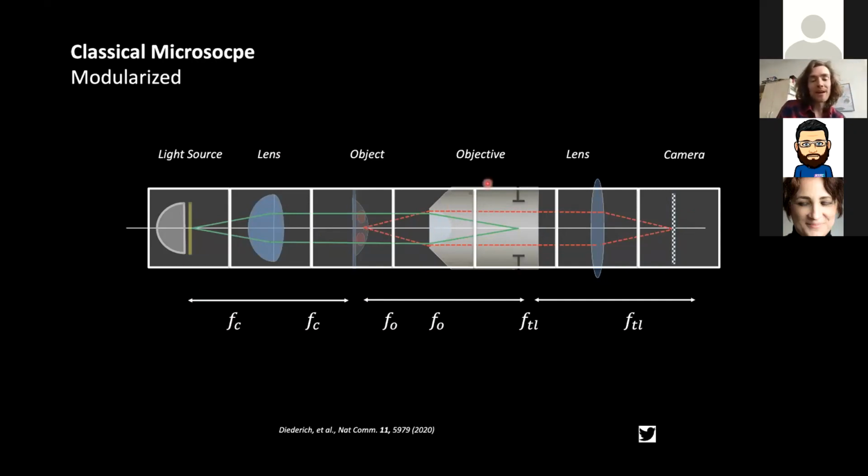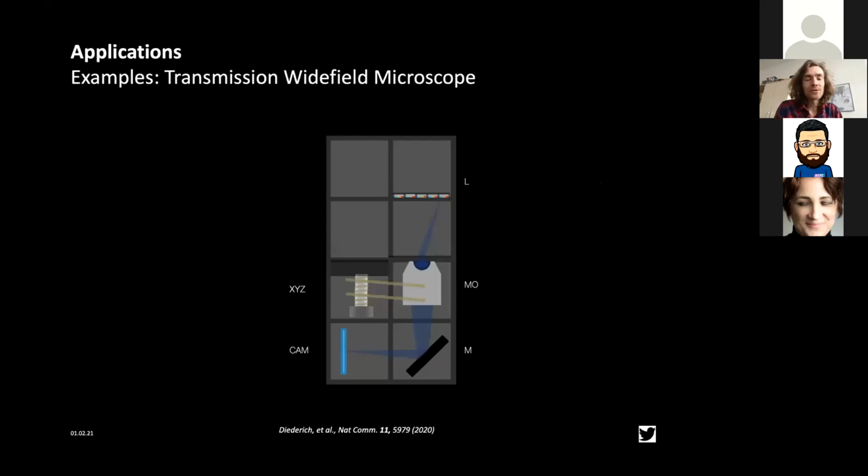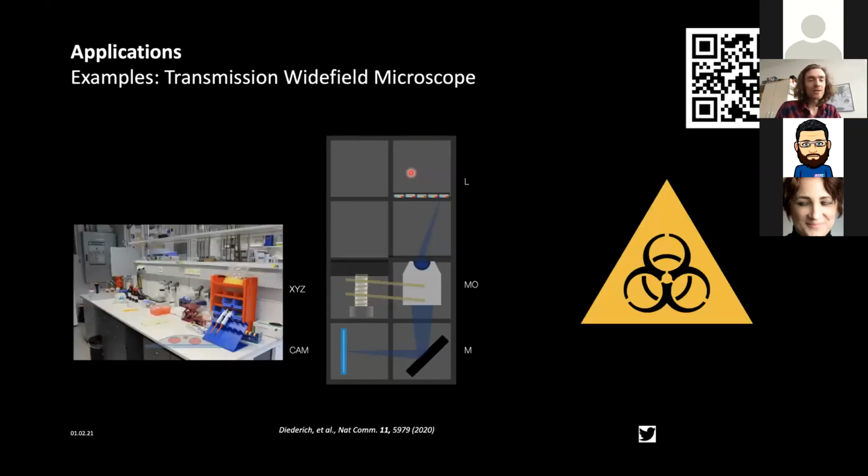And we did that by designing small cubes. And that's the first project I'm presenting you right now. So that's UC2, for those who haven't ever heard of it till now. And so the cool thing about it is once you have kind of a library of cubes, you can stack them together or orient them the way you would like in order to build, for example, a microscope. And this is already directly helpful for the biologist. We presented in the very first slide, because this one here can go into a biosafety lab.